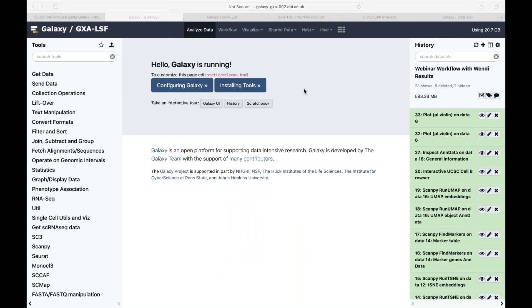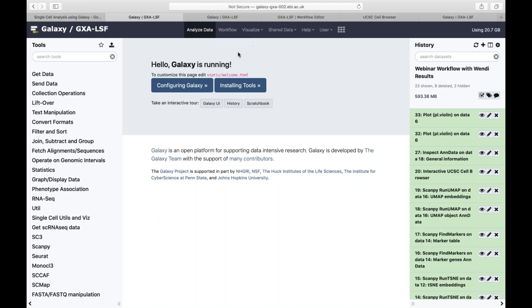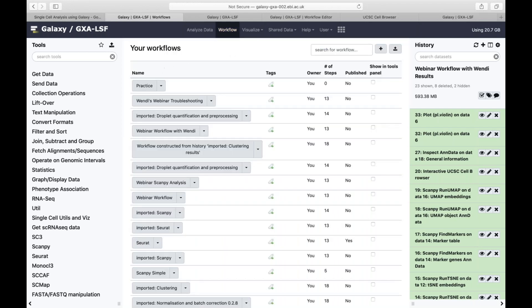There are many different Galaxy instances. I'm going to give you a link at the end to the public versions that you can access, which have a lot if not all of the tools I'm going to use today. I just wanted to take you around how Galaxy works and what it might look like for you. This is an instance we use here at the EBI — the one we used in our training course a couple of weeks ago.